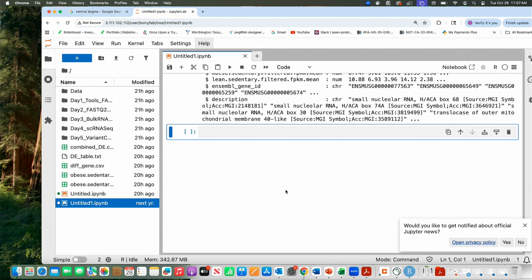So basically we have 4 commands which we think about: head, ls, dim, and str. What we are doing here is, when you get a data, it doesn't mean that as soon as you get the data, you just start plotting it.